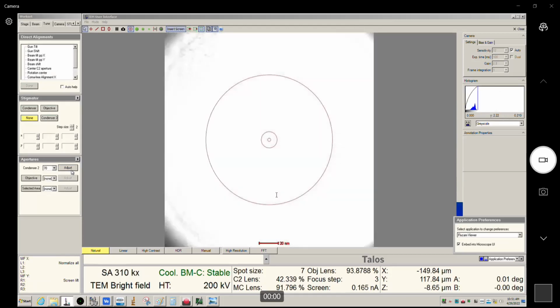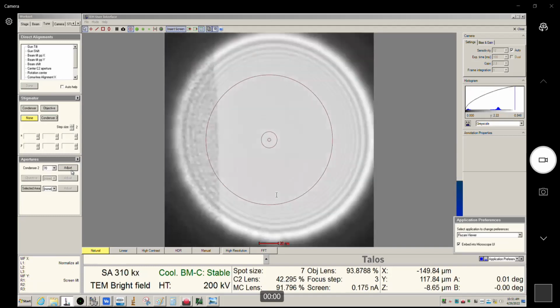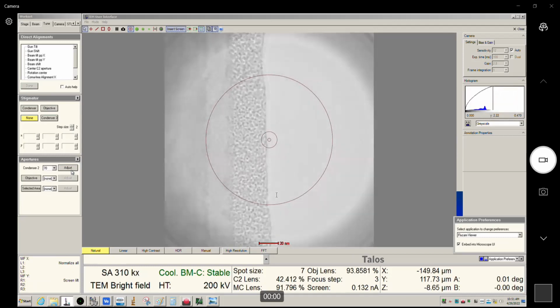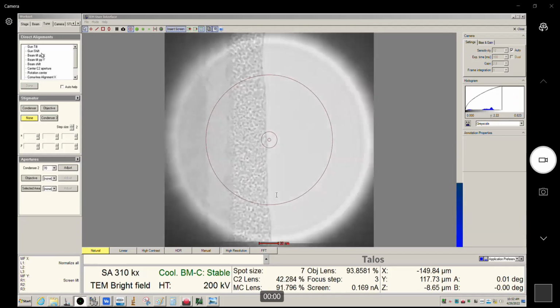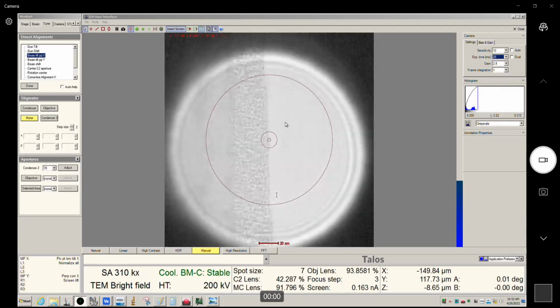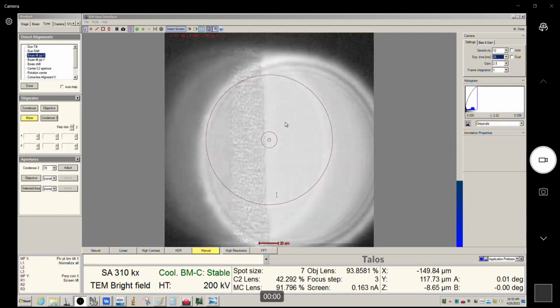But hopefully you know where I'm going with this. So this will give us the ability to do like a long exposure, okay, to get enough signal, but I'm not going to cook the sample, okay? All right, so let me go ahead here, redo the pivot points. Make sure you're grabbing the right knob.